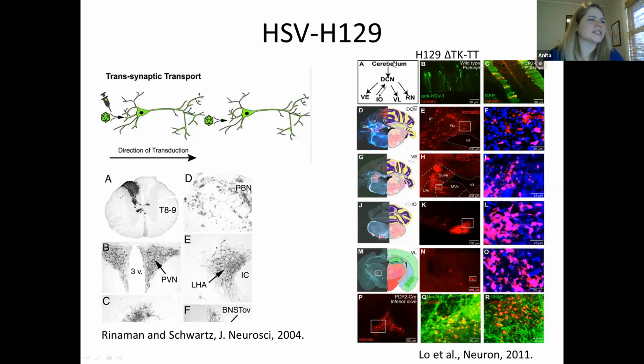So in the case of the Scott paper from 2014, I think they only looked at the first order connection anterograde. And basically they wanted expression of the fluorophore in this cell. So with normal projection tracing, you just have the projections, but you don't know the identity of the postsynaptic cell. In this case, the postsynaptic cell would express GFP, so you could, for example, sequence it or counterstain it with other markers. I don't think this is widely used, so that's why I didn't spend a lot of time on it.